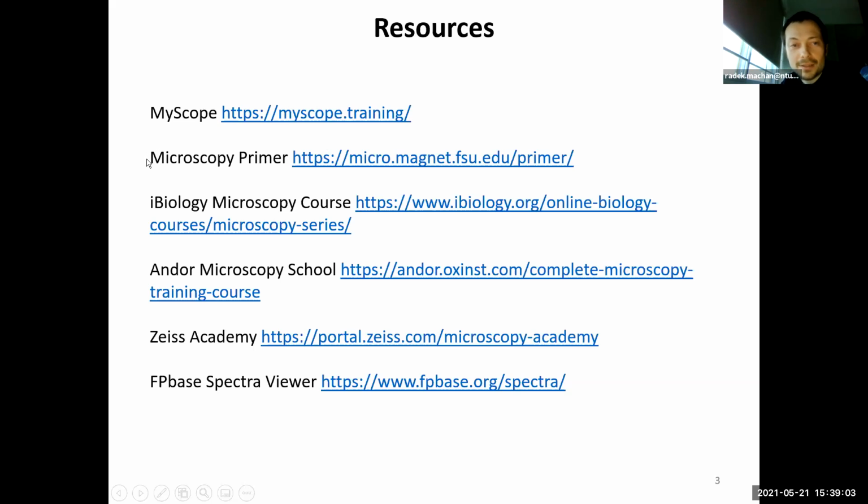Another, which is a very classical source, I would say, is called Microscopy Primer. It's quite an extensive website which contains a lot of microscopy related things.